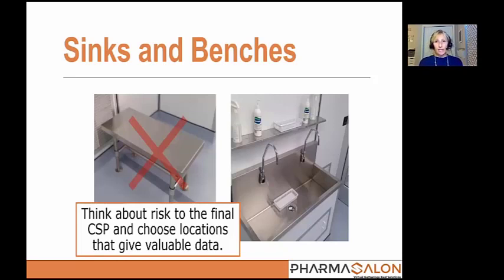Now, from the sink standpoint, this is a freestanding sink, which makes it kind of difficult to sample around it. But if you have a sink that's incorporated into a countertop, like a long counter, you know what that sink looks like: they're splashing and spraying and there's water all over the place.